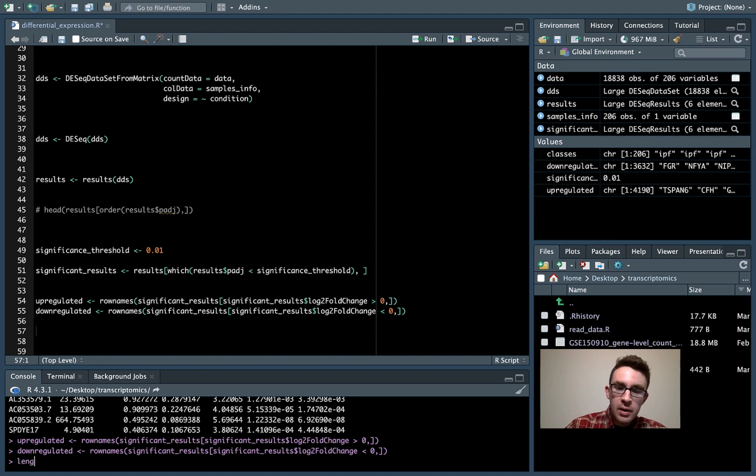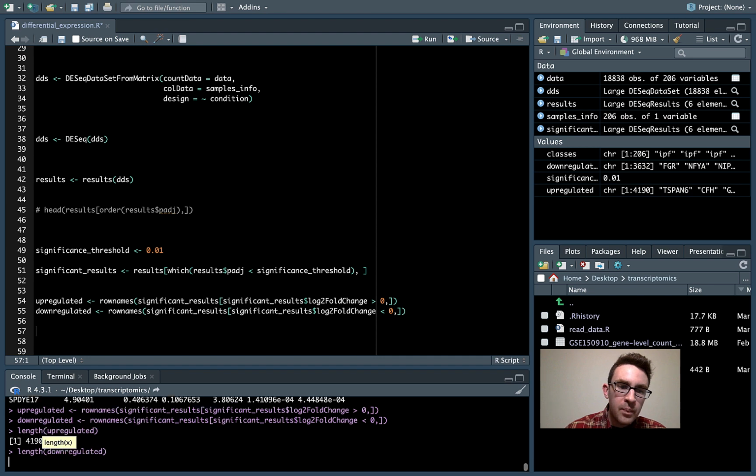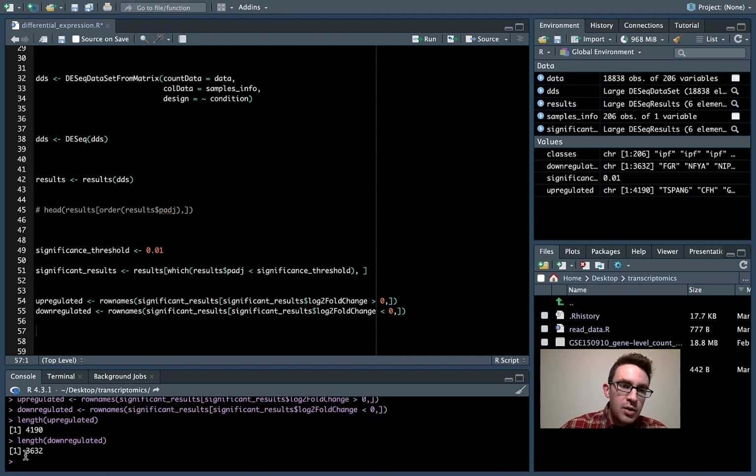So we can see length upregulated, 4,190 upregulated genes, and then length downregulated, 3,632 downregulated genes. And yeah, that's quite a lot. That was actually more than I was originally expecting to get. But yes, that's the result for this part of the video at least.